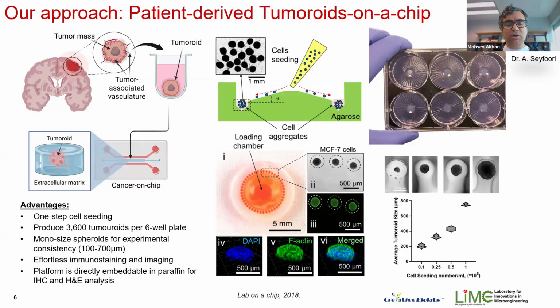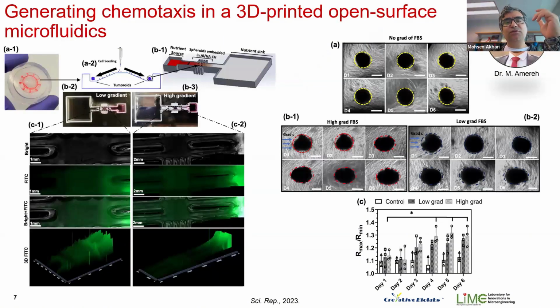So, a few case studies. In this case, Maytham, a PhD student in my group, decided to apply this approach to investigate the impact of chemotaxis within the tumor microenvironment, and investigate the impact of this chemotaxis on the tumor remodeling within the tumor microenvironment.